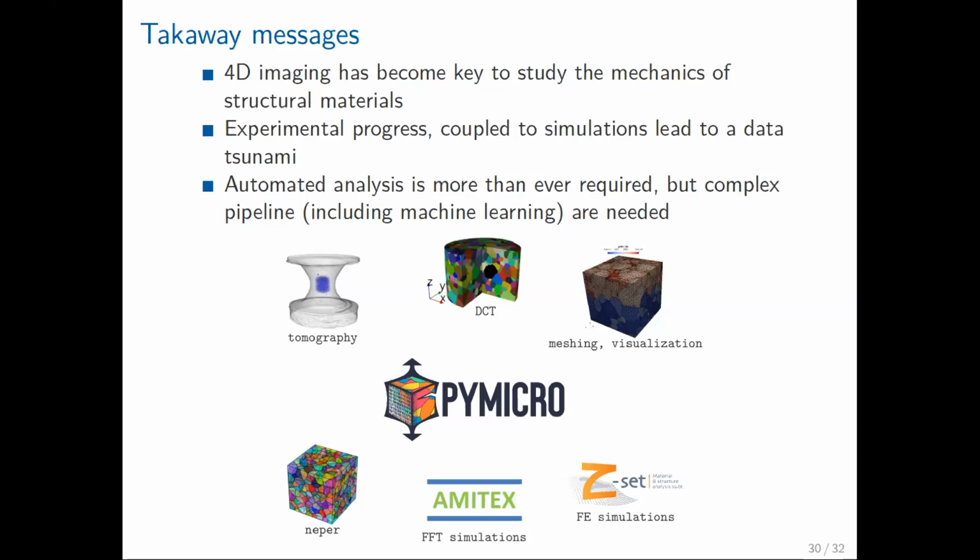So I guess the answer is yes. We will show you some examples to some extent. We show you some examples in the data platform, which is actually meant for that, to manage more efficiently and to use better compression algorithms. There's a lot of progress that can be made. The downside is that at the moment, speaking about those experiments, we don't really have access to the acquisition system, so we cannot plug into it. Right now the data is generated first, and then at the post-processing step we repack it in an efficient way for the analysis. So we sort of duplicate it.